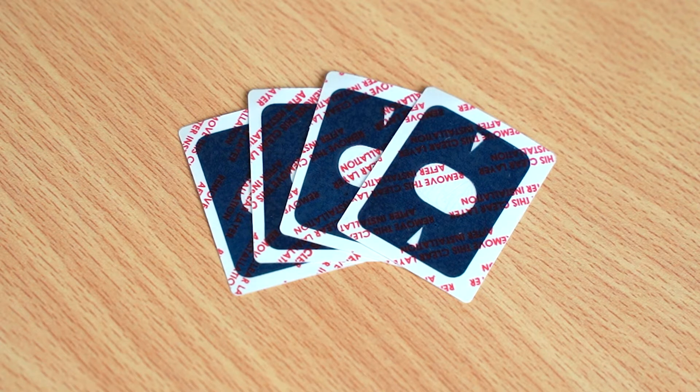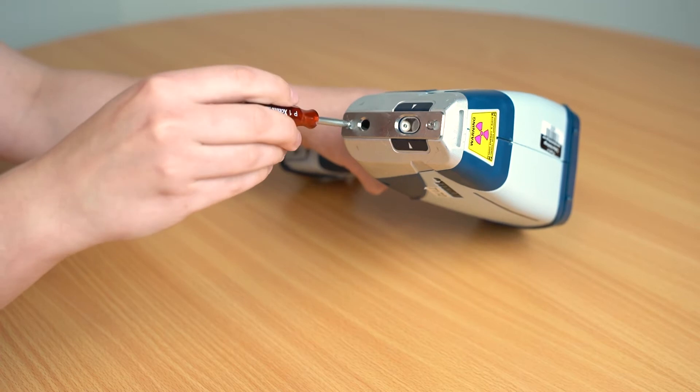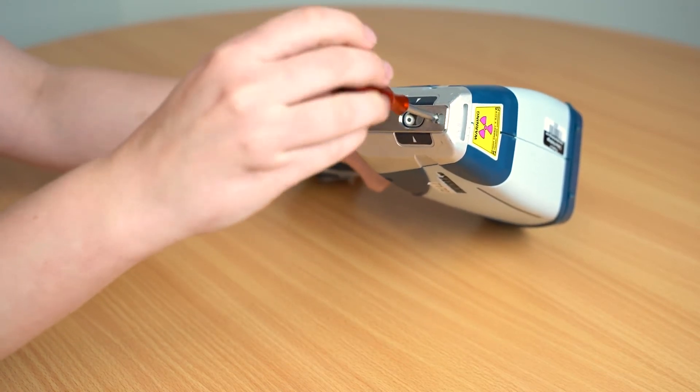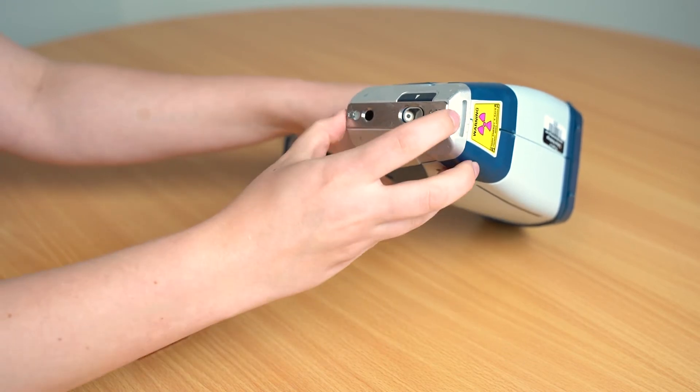Depending on the brand of instrument, your window might look slightly different to the instrument I'm using today, but the essentials are still the same. XRFs generally have a metal plate that is attached by small screws. Unscrewing and removing these will reveal the window.